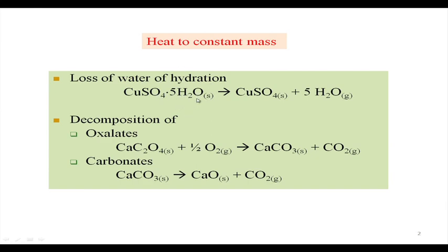There are 5, it is pentahydrate, that is copper sulphate pentahydrate. If we heat it, not all 5 water molecules will go out in a single step, but one is different compared to the other 4. So, initially we get the sample which is copper sulphate monohydrate, and we also see the color change. That is another good indication for those samples which are colored, unlike your calcium oxalate or magnesium oxalate samples which are white in color.